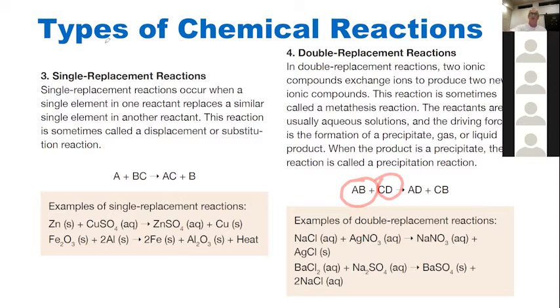So you take two solutions, like in this instance, sodium chloride and silver nitrate. When they're apart, they're completely soluble in water. But then when you put them together, once silver comes in contact with chloride ions, boom, they crash right out.